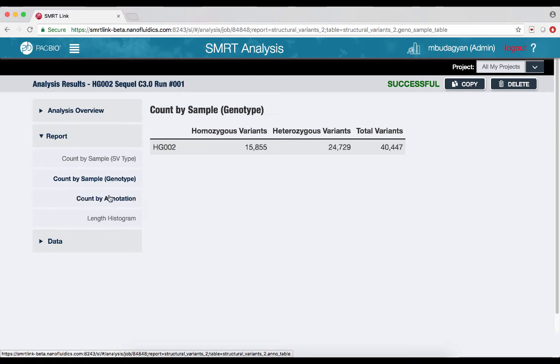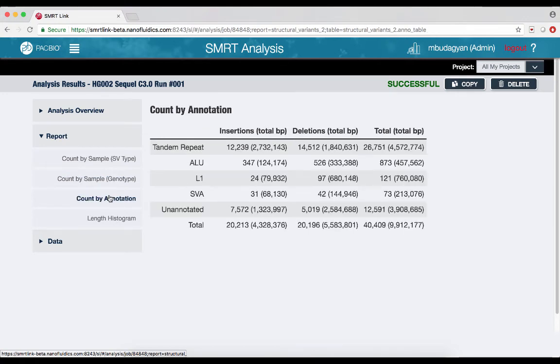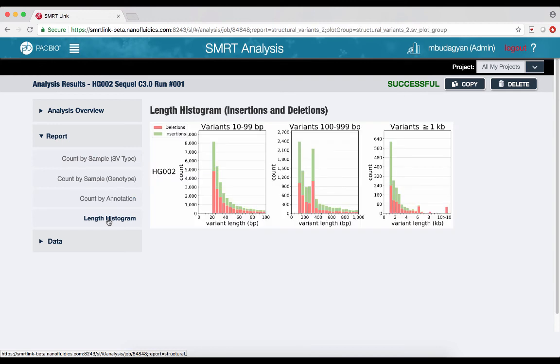The report Count by Annotation section presents insertion and deletion variants grouped as tandem repeat, ALU, L1, SVA, or unannotated — which are mutually exclusive and completely exhaustive categories. This set of annotations is hard-coded and specific to human. The report also includes three histograms in stacked bar plot format that display the length distributions of called insertions and deletions for three different length ranges.